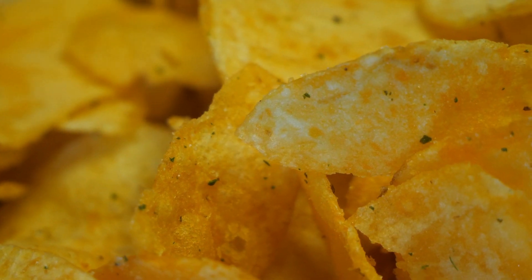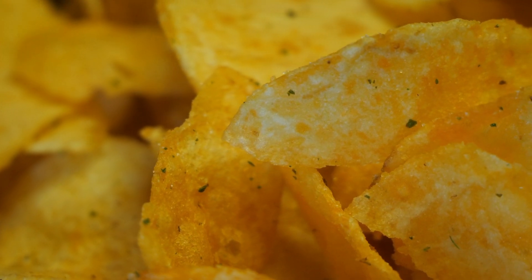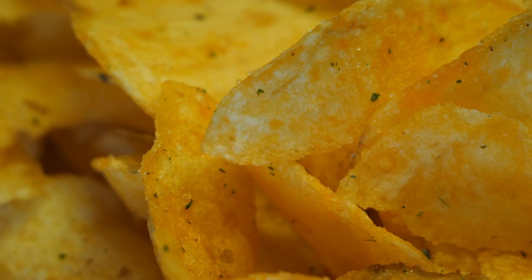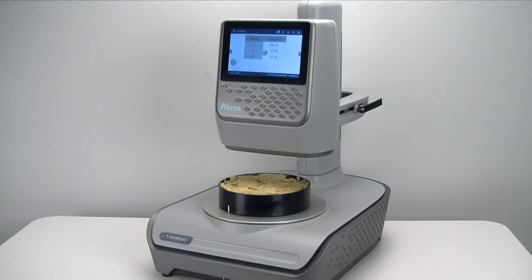The big challenge to evaluating the color of chips is that they are irregularly shaped, which causes inconsistent color measurement. HunterLab's exclusive unique chip color measurement solution featuring the Aeros is the number one proven way to measure the color of samples such as chips.